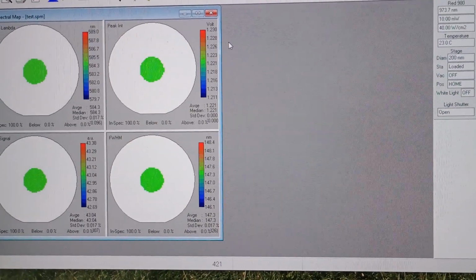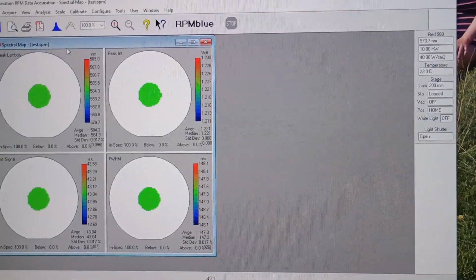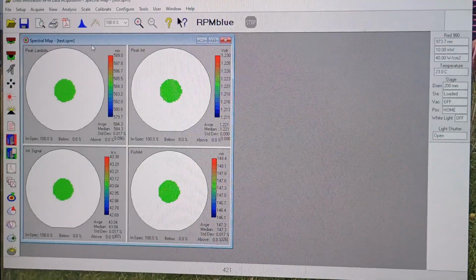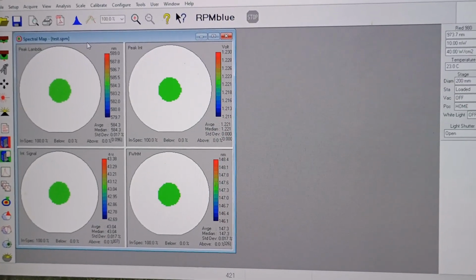And then it's automatically saved the data in the process of acquiring it, so there's no need to do any more. So if your recipe creates a report file, then your database can automatically grab that from your machine, and your data goes in automatically.